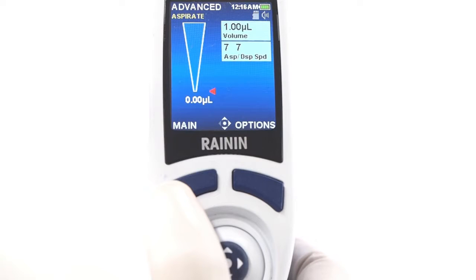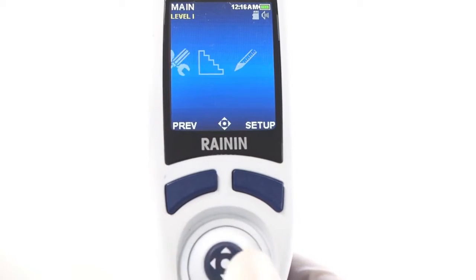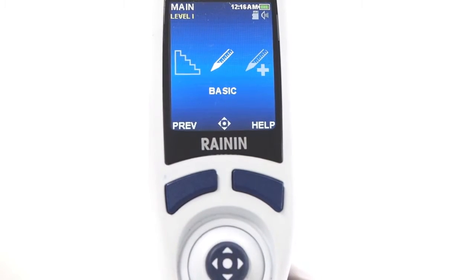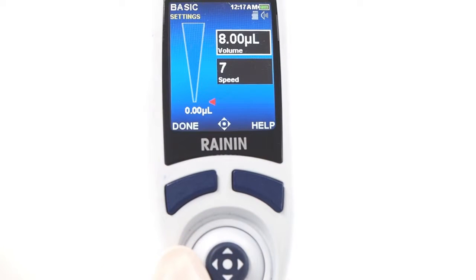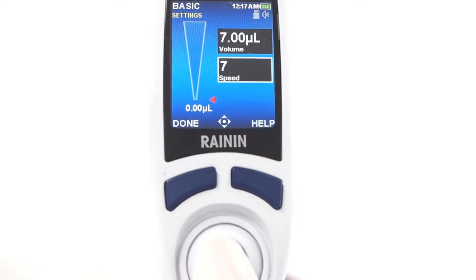Press main and joystick to cycle through the two levels of modes and other selections. Press the joystick up to make a selection. You can also press the joystick in to make a selection. To adjust settings, joystick right. To modify the value inside a highlighted box, press the joystick in. Left and right move in larger steps; up and down, finer increments. When a value is correct, press the joystick to set it and move on. You can also press done.